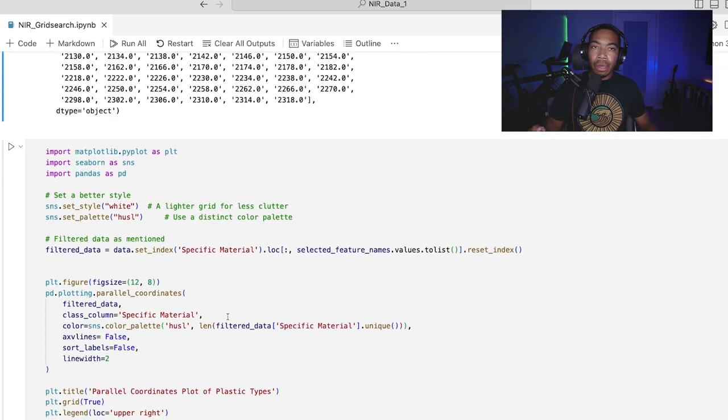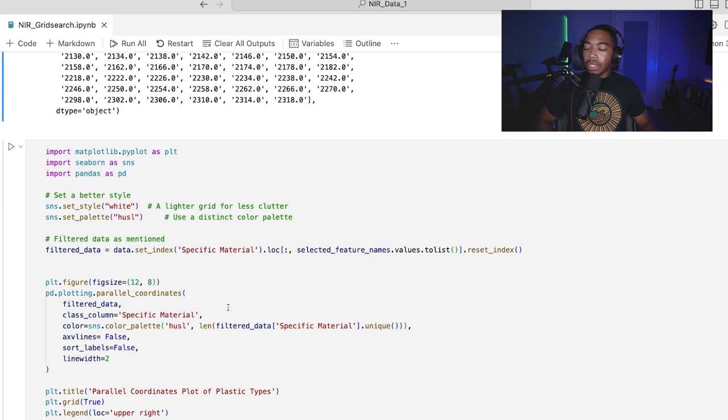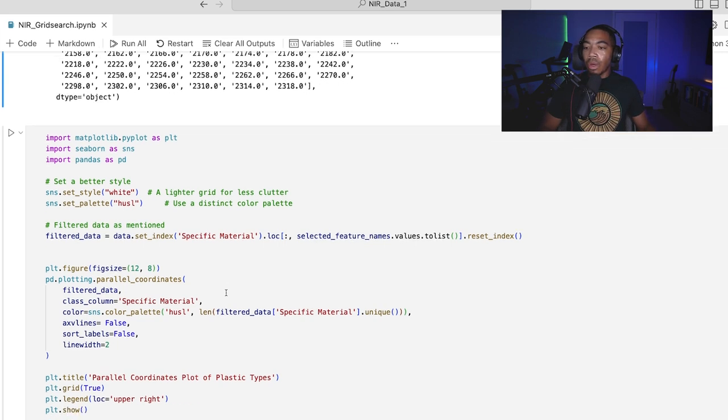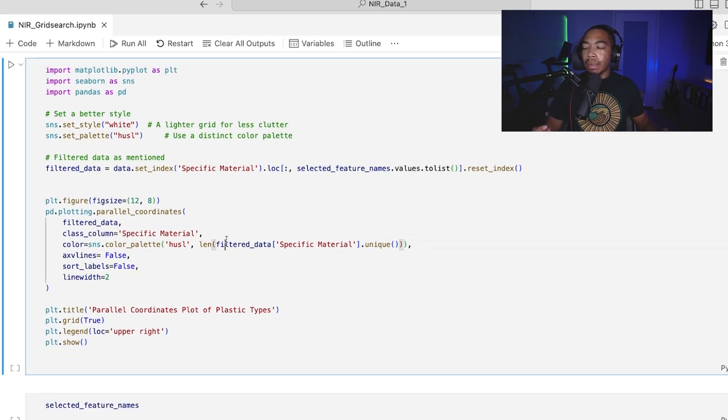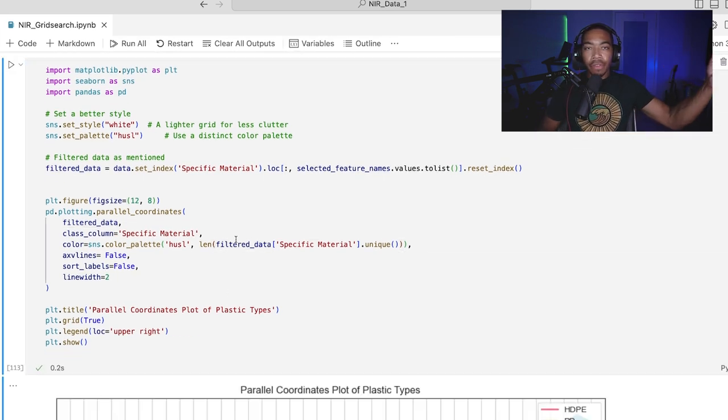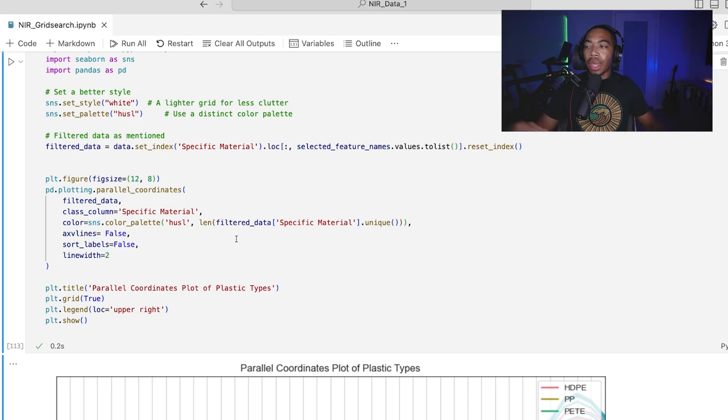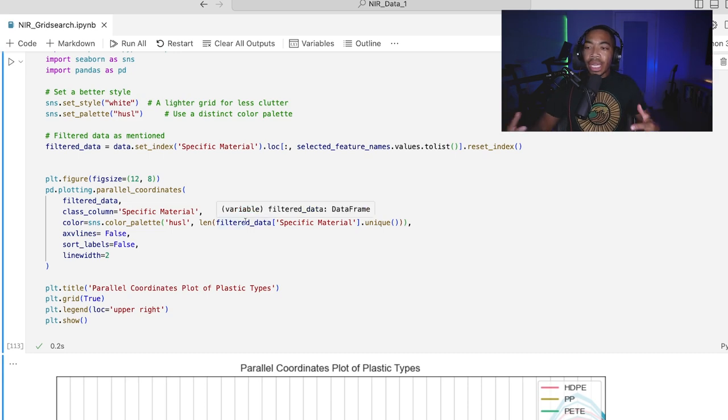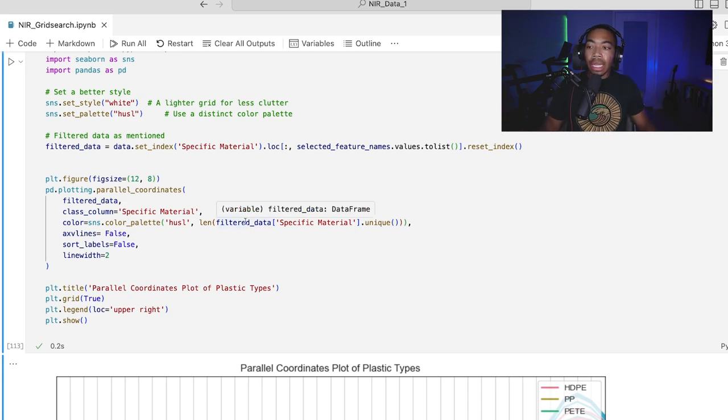And so how I generate this particular figure is less important. There are many ways to generate a parallel coordinates plot. But I want to show what it looks like when we can combine what we've done for feature selection, how we built the model, and what that data approximately looks like.